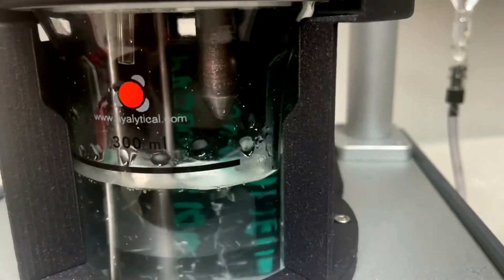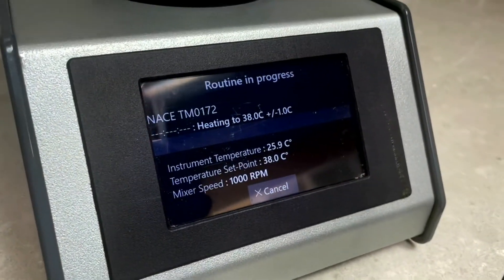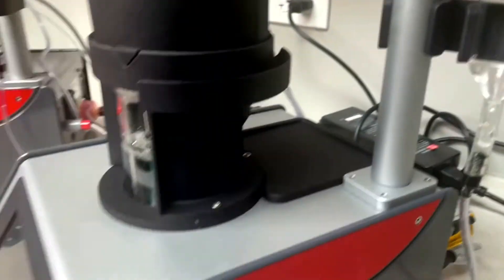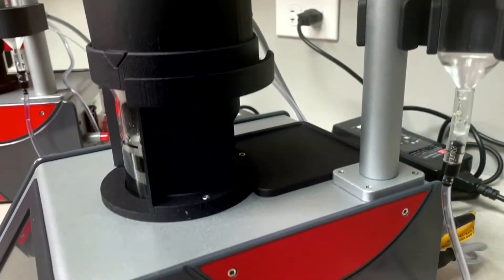The Anna will run automatically, dropping the specimen at the prescribed time based on the temperature. After a period of time as defined by the test methods, the specimen will drop into the beaker at the end of the test period. The specimen then raises out of the liquid to stop any further reaction. And as easy as that, that's how you run our Anna instrument.